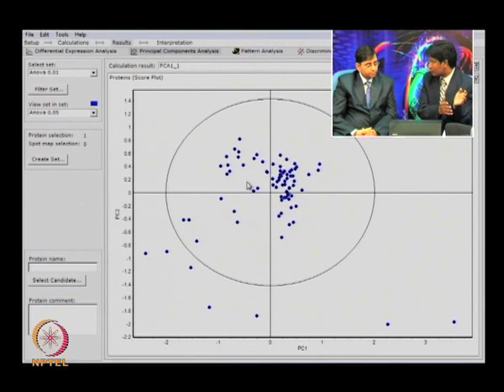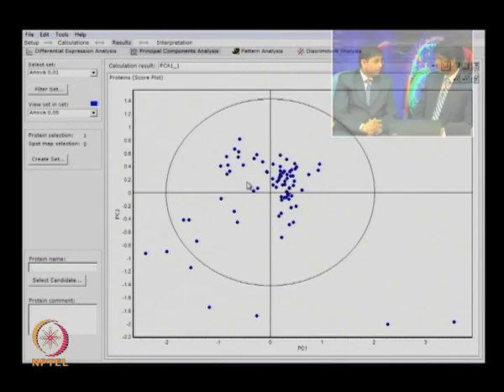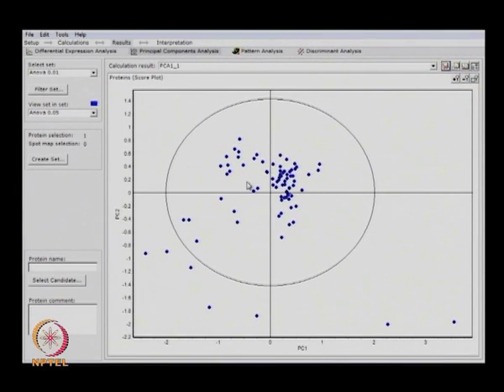Then we have to go back to our BVA data and check exactly how that protein is regulating. Then we can identify that protein and use it for further analysis. So this is a powerful statistical parameter. Exactly. By using it you can identify some outliers, which could be the potential discriminator between the control and treatment. And once you identify those proteins, you can go back to your original data from the BVA and get all the analysis done. Exactly. Oh, this is very interesting.